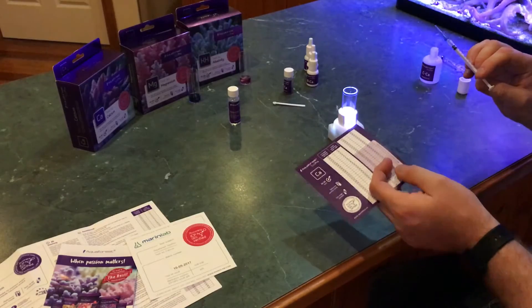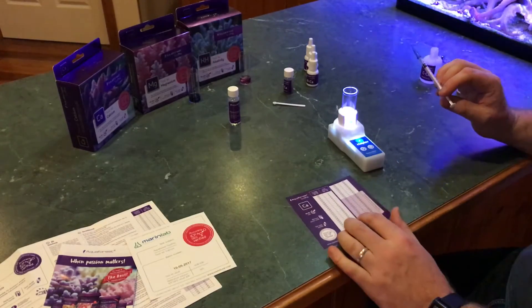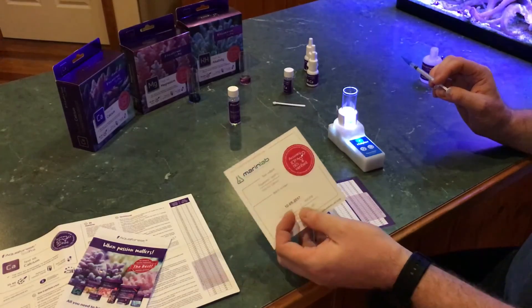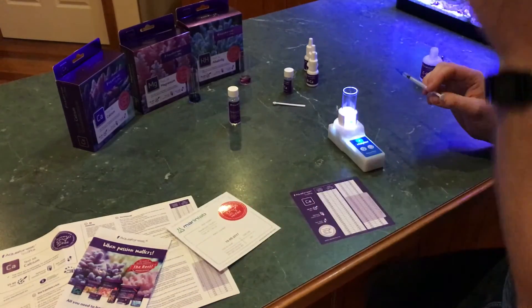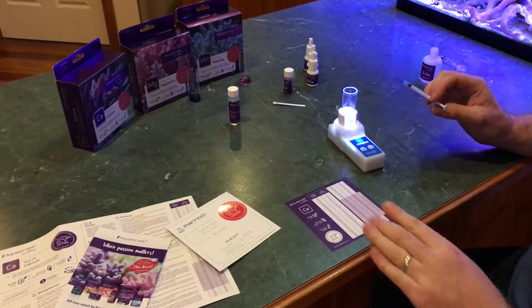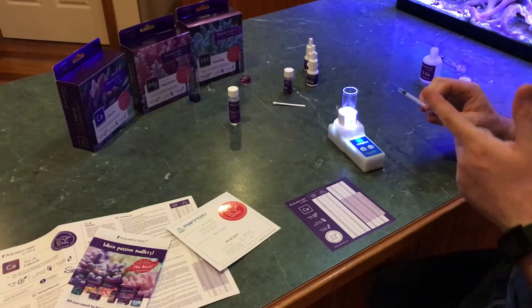Pretty accurate compared to my in-date Salifert test kit. Which one's more accurate? You guess — this one does come with ICP verification. Up to you whether you trust that more; I can't see any reason not to. They're both within range.